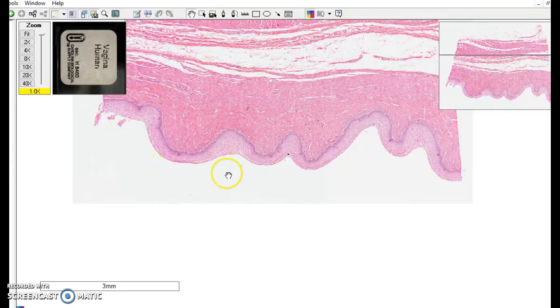So this is the surface. This is the more meaty part of the vagina and you can see this very distinct boundary between this tissue and this tissue. This tissue has a basement membrane and a basal set of cells, and then it reaches the body surface, which in this case would be the inside of the vagina.